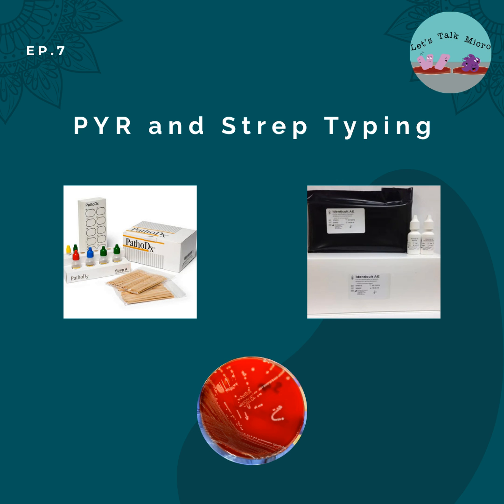Now, as part of this show, I always like to share what I have seen while in the lab. So I'm going to tell you something. When you're typing, get your colonies from a blood agar plate. And you microbiologists out there listening to me say this, you're like, I know where he's going with this. So yes, like I mentioned earlier, some species of strep can exhibit all three types of hemolysis, meaning they can be alpha, beta, or gamma hemolytic. Well, Enterococcus, and this is true of faecalis, can exhibit all three as well on blood agar.